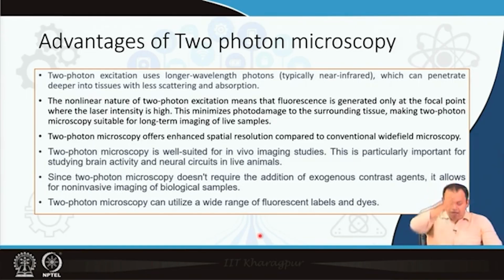So, the total is equal to 3, and these individual photons are generating a virtual state that should not have been existing in the first place, but in nonlinearity some weird things happen as we have seen. A virtual state opens up inside the band gap where the photon can simply jump and come up.